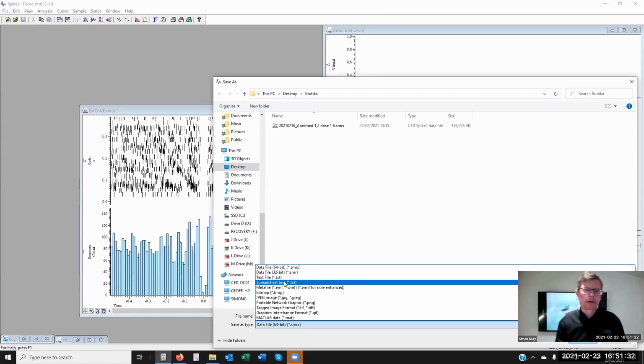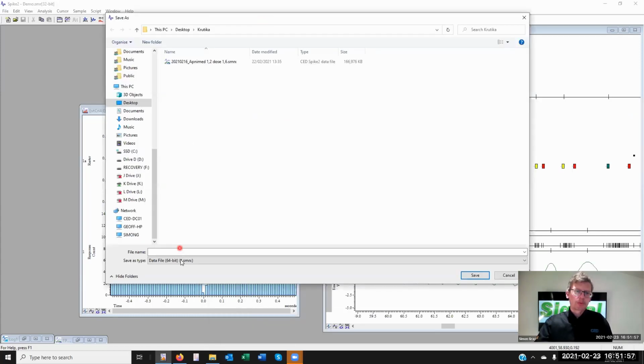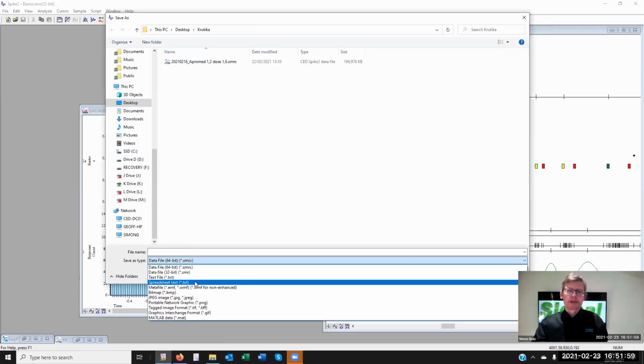Text file, as I mentioned in the first of these sessions, is logical channel 1 with a header or not, its data points, followed by a small break, then channel 2, logical channel 2, and so on and so forth. So it is not a nice rectangular output, as you would expect it to be for taking to Excel, for example. So that's why we put in spreadsheet. And spreadsheet allows us to resample all of the data to a common factor and get this nice output.